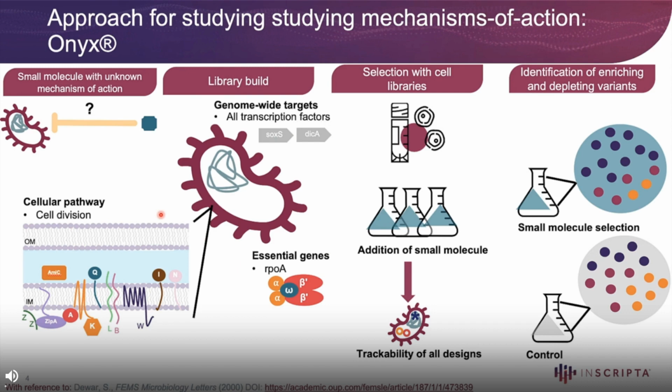And you're also able to target entire cellular pathways. In the work that we did, we built a library that specifically targeted the cell division pathway, in addition to an entire morphology and protein folding library.